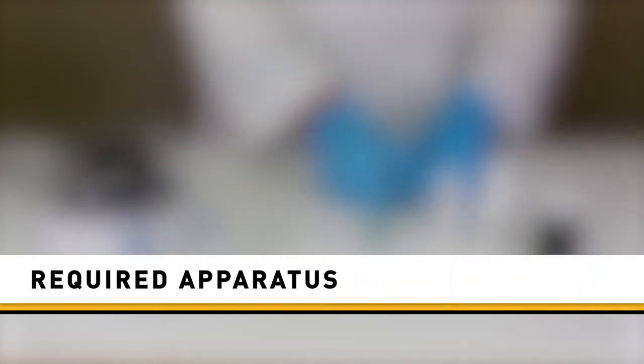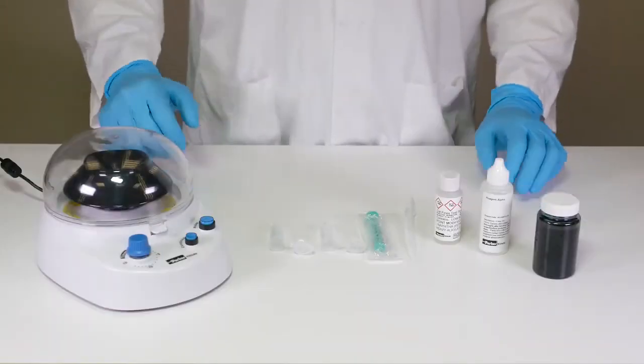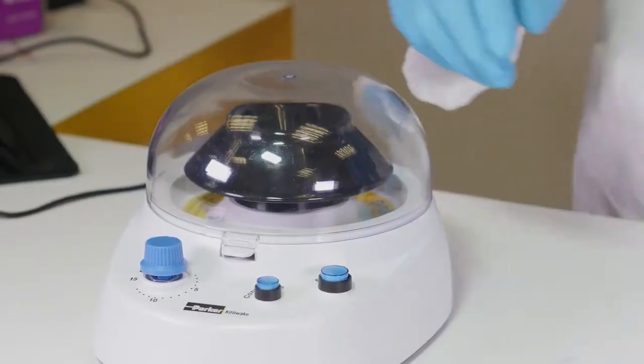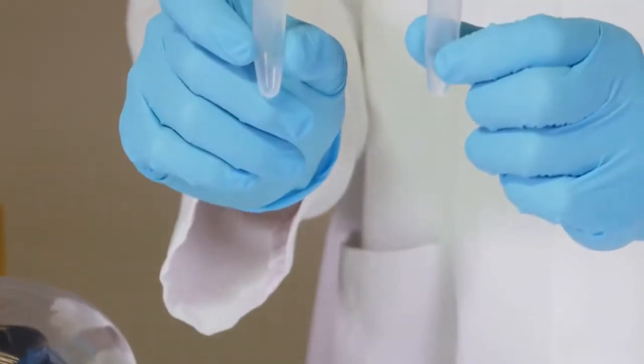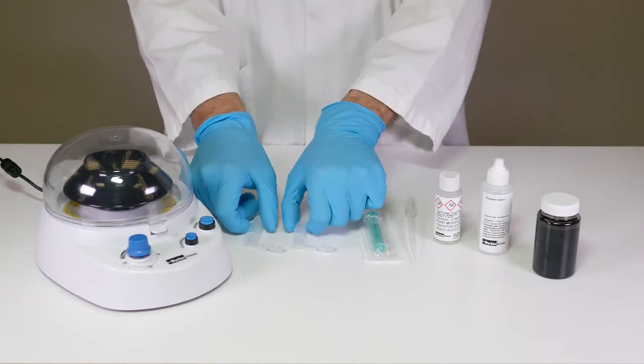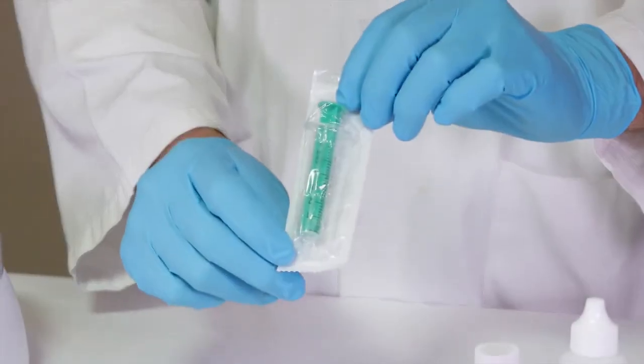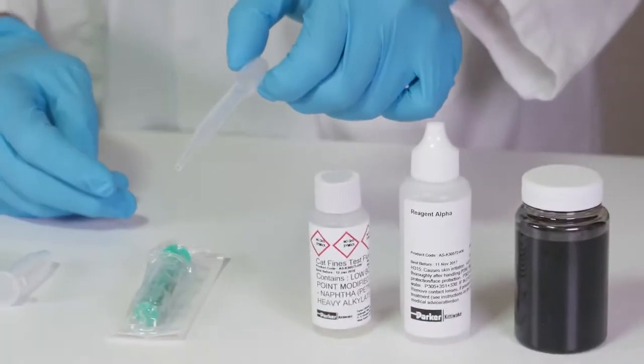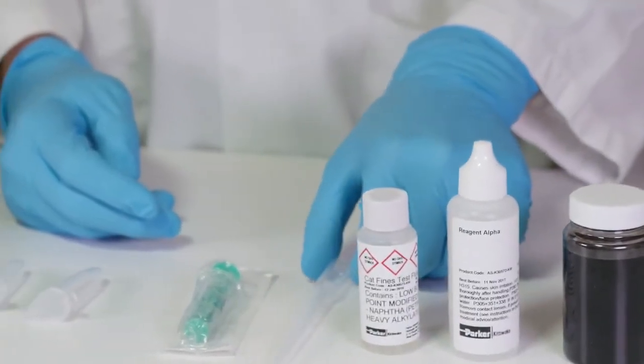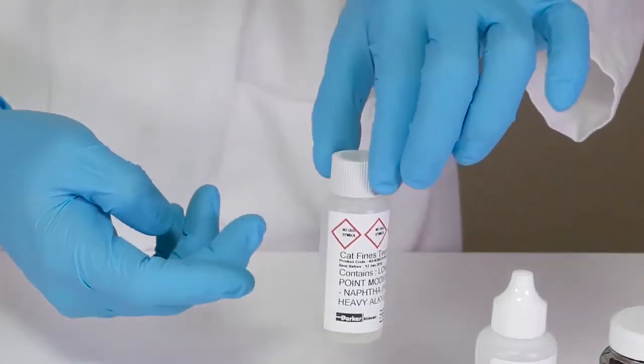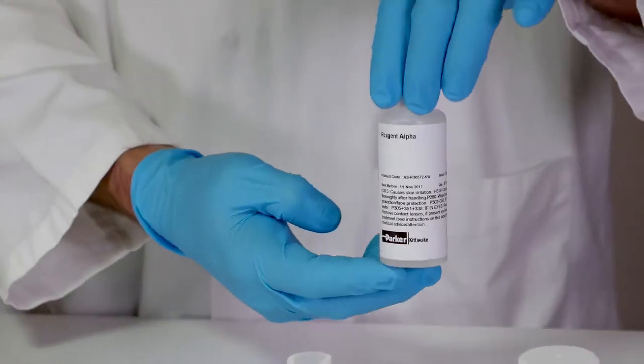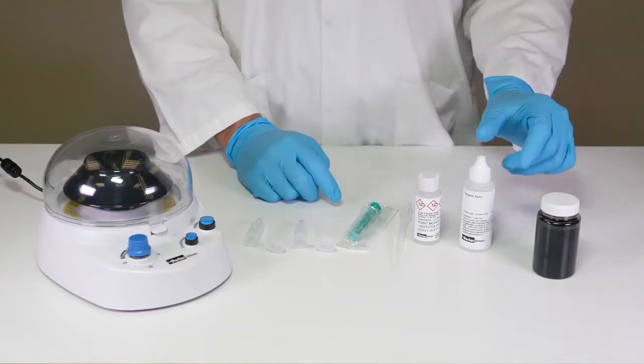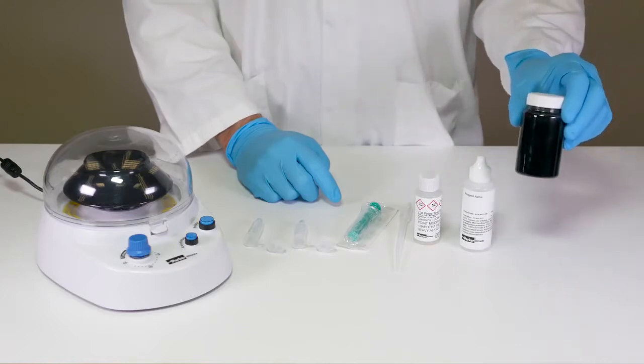In order to run a cat fines test, you will require the following: a Parker Kittywake centrifuge, five milliliter sample test tubes, five milliliter sample syringes, an extraction pipette, a pre-prepared bottle of test fluid, a bottle of reagent alpha, and your heavy fuel oil sample.